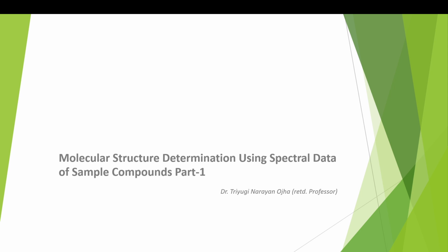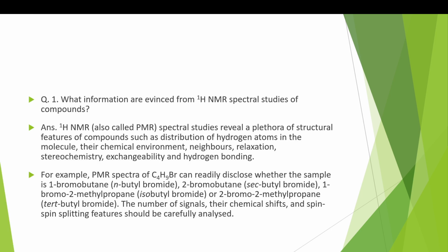Dr. Pianoda here. In today's video, we will discuss a number of problems in which molecular structure is determined from the spectral data, NMR data. The first question is about what information is derivable from H1 NMR spectra.